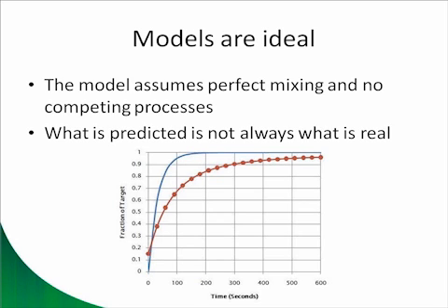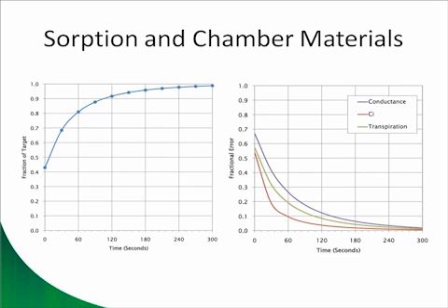And what does this difference due to? Well, water is really sticky, and it likes to absorb into the chamber walls and anything else in the chamber. And so what this does is it effectively increases the amount of time it takes for the chamber to stabilize, because we've got this competing process. We have water exchange going on with the chamber walls.